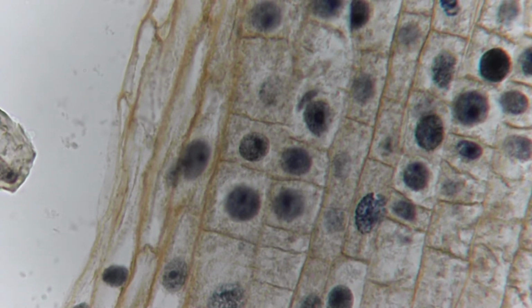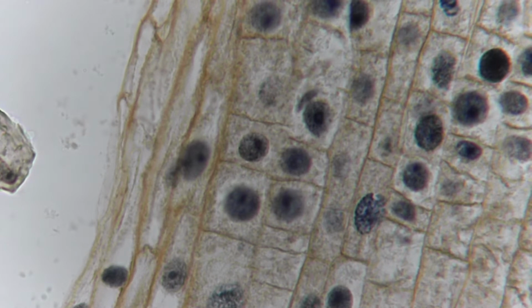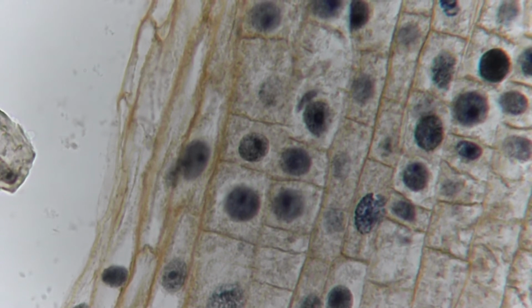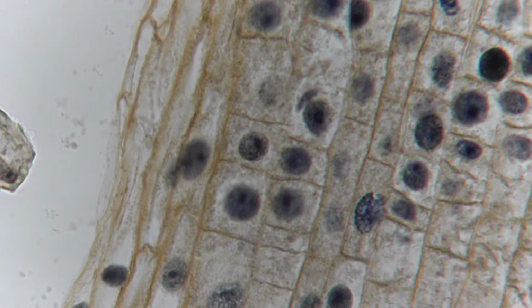So from left to right and top to bottom, there'll be interphase, prophase, metaphase, anaphase, telophase, and daughter cells. Those will be your 6 subheadings. And I'm going to give you a corny crutch to remember these in order. So right there on your lab menu, if you want to underline what I'm telling you, underline the I on interphase, the P on prophase, the MET in metaphase, the A in anaphase, the T on telophase, and the D on daughter cells.